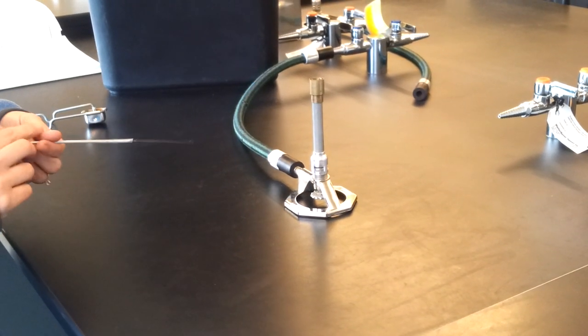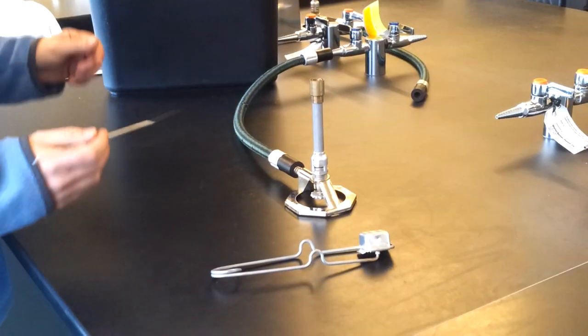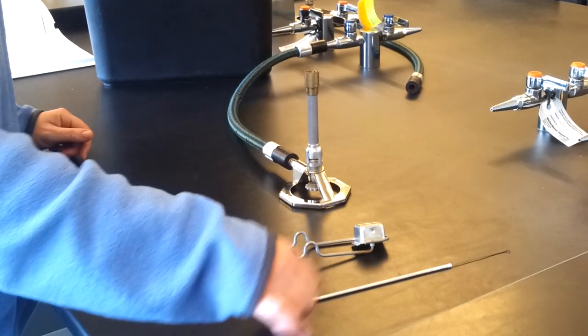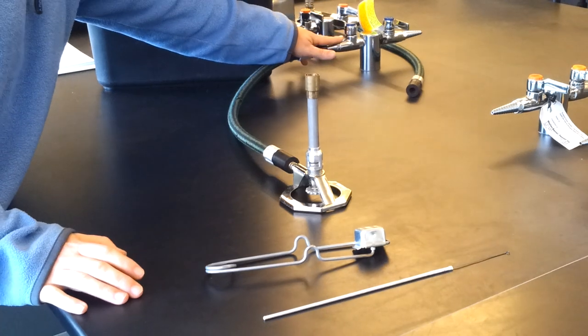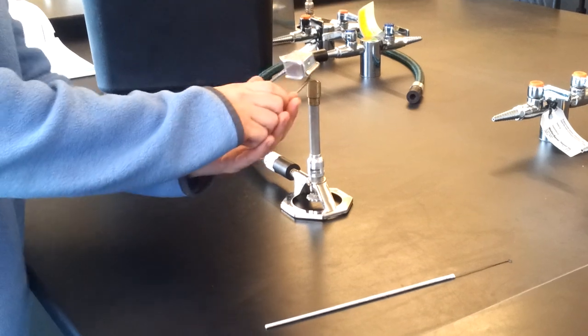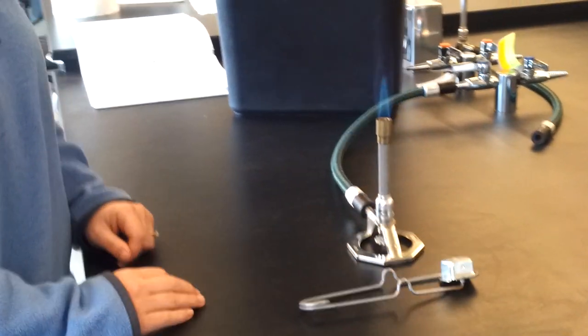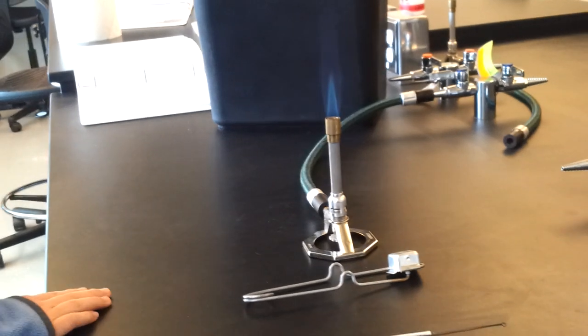Now, to turn on your Bunsen burner, you're going to need a striker. So I'm going to move this parallel so the gas is on, and then I'm going to strike over the top of the Bunsen burner, and that's actually a perfect flame right there already.